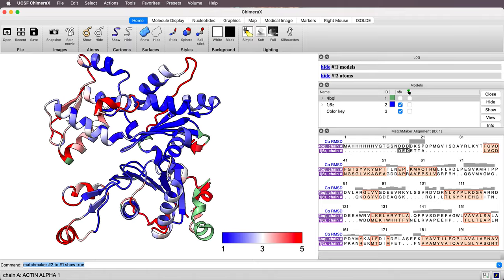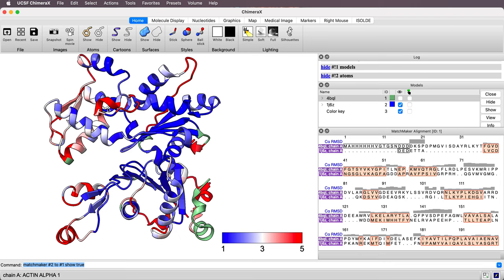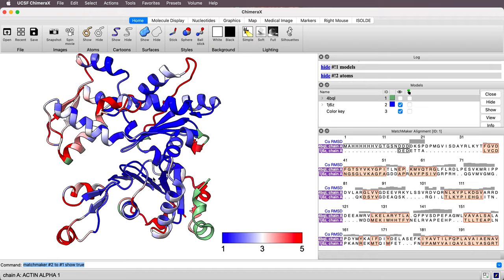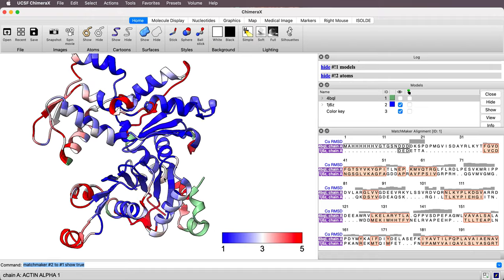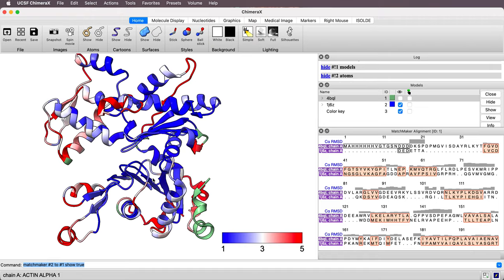And there we go. That's what we wanted. The blue, dark blue regions are the close C-alpha positions that match closely, the residues that match closely. Red are far away and green are ones where there was not a correspondence between the two sequences. Thanks for listening.